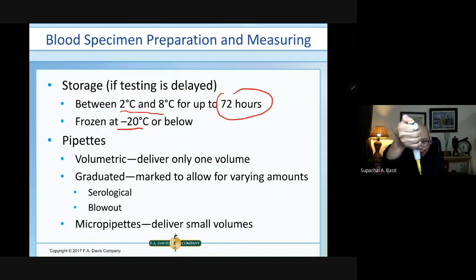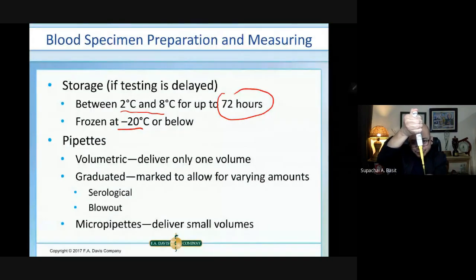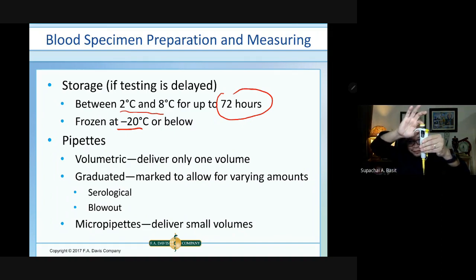First push is to aspirate. Second push is to deliver. The reason why some students are getting mistakes during pipetting is that when they aspirate, they are pushing up till the fullest push, 'di ba? So I hope you can go to the laboratory during your face to face so that you can experience the first push and then the second push. The first push is to aspirate, then the second push is to deliver.